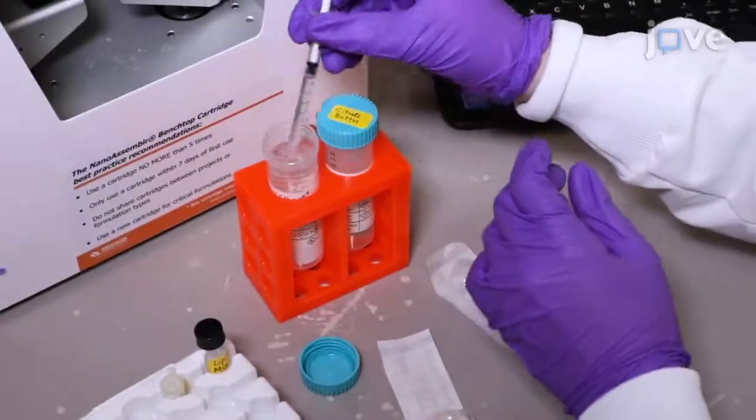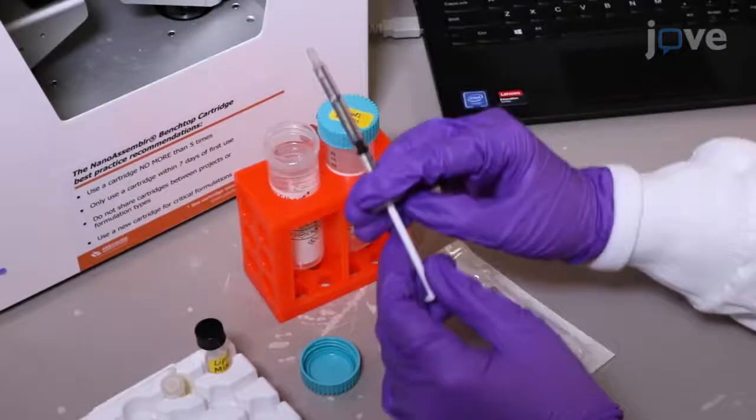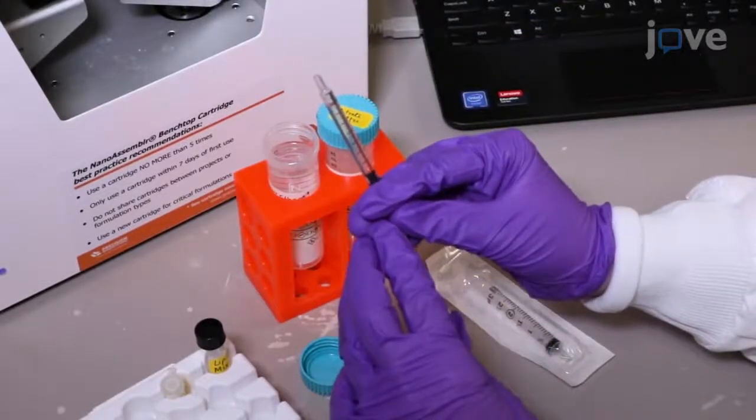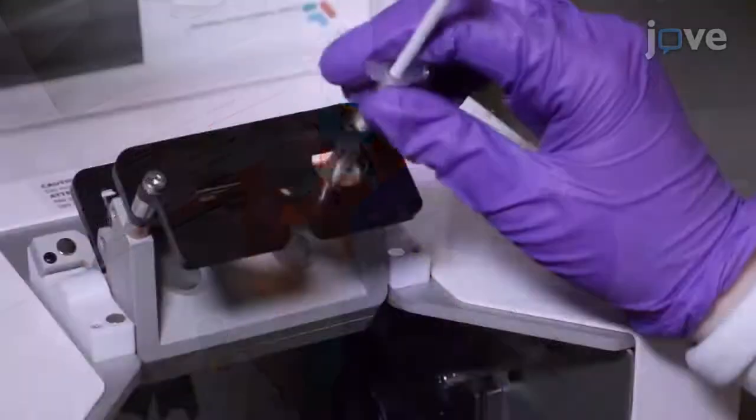Load at least 500 microliters of ethanol into a 1 milliliter syringe, taking care that there are no bubbles or air gaps at the syringe tip, and insert the syringe into the right inlet of the cartridge.